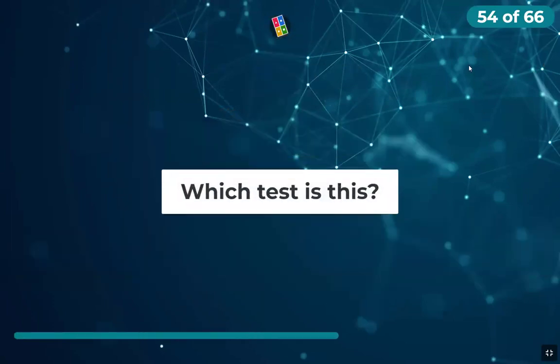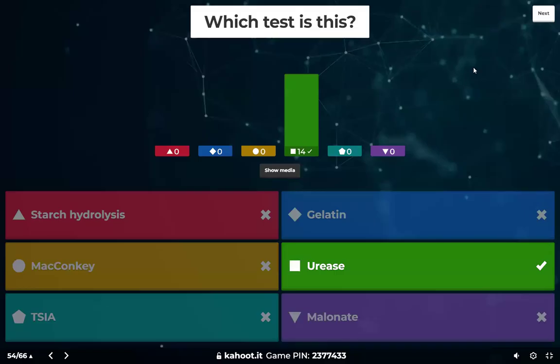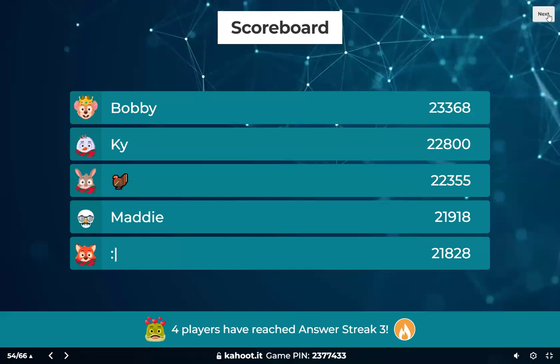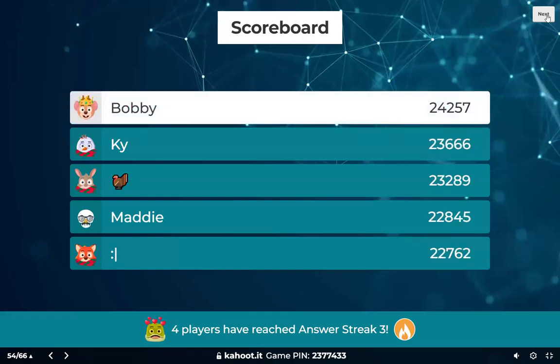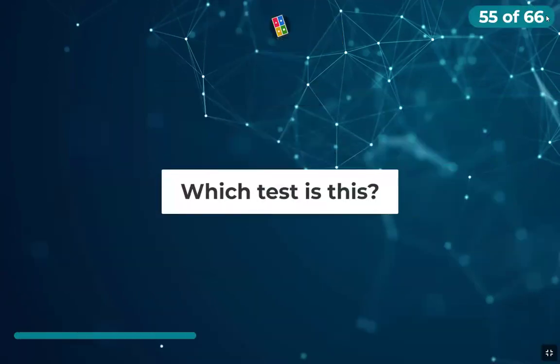All right, which test is pictured here? This is one that we didn't do in lab. So this isn't the picture. If I have this one on the test in lab, this isn't the picture you'll see. You'll see the one from our actual notes that are provided in the lab part of the Canvas module. It says urease test. Urease is the name of the enzyme that breaks down urea into carbon dioxide and ammonia. Ammonia is notoriously alkaline. Okay, ammonia, alkaline.